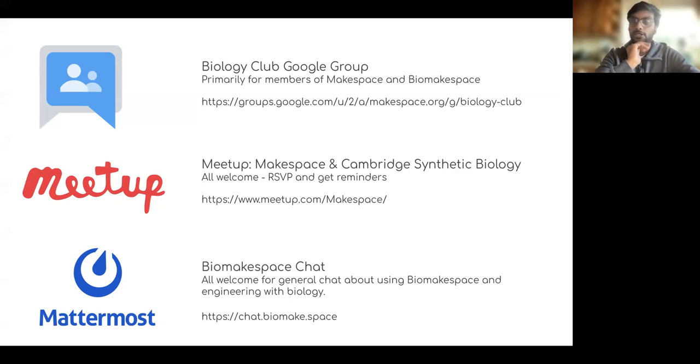So today we're going to talk about lab automation, and it's an open discussion to see how different fields can help in automating small aspects in biology labs. If you're a biologist, you'd already know how we struggle with repetitive experiments or repetitive tasks in the lab, and how new introductions such as the OpenTrons robot or any liquid handling robots and programming are actually helping biologists to automate and then make these things interesting.